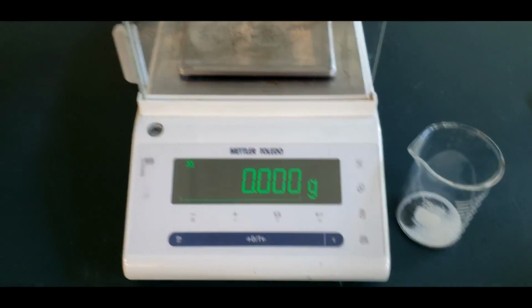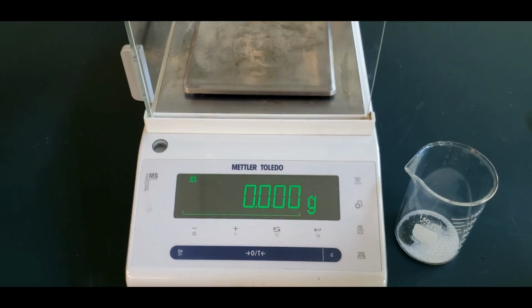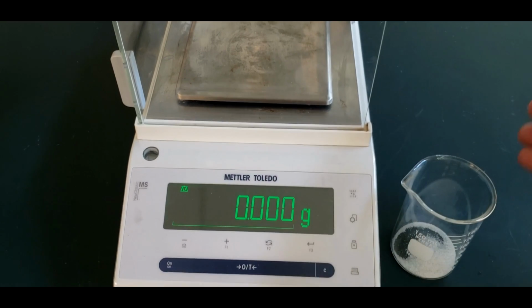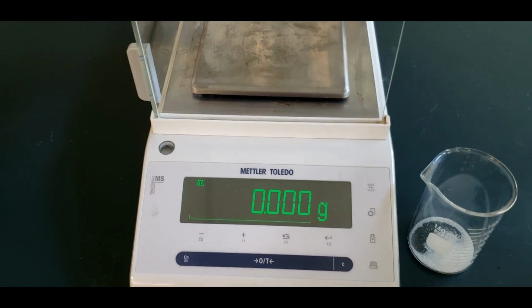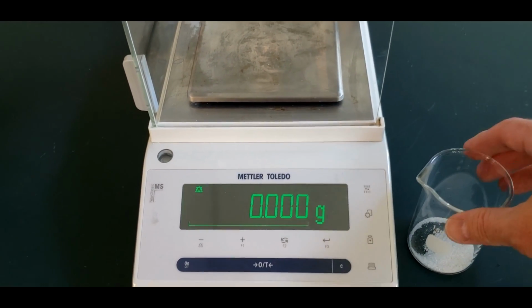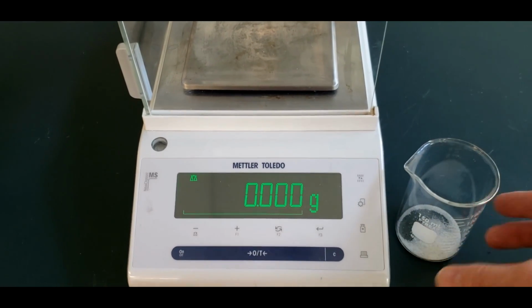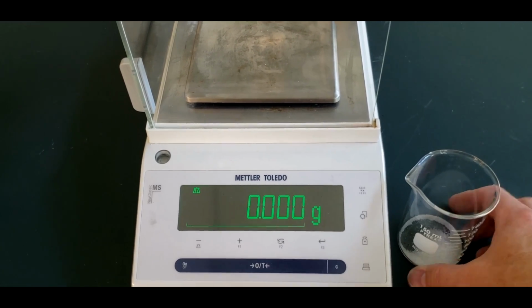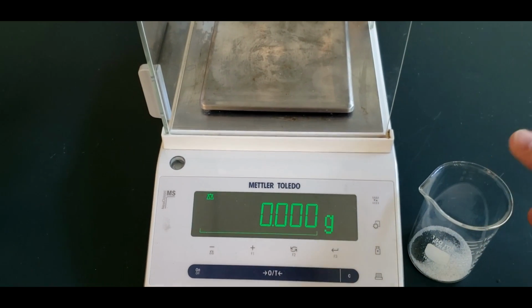And now students will ask, how do I know when it's cool enough to touch? Well, first, if you're ever in doubt, you can just put your fingers by it. If you feel heat coming off of it, it's too hot. But what I always do is just let it sit for 5 minutes, and you're guaranteed for a beaker, at least the top you should be able to touch. And then from there you can just see if it's okay. But this has been sitting almost for 10 minutes, and the bottom I feel is just slightly warm. But yeah, if you're really concerned, just let whatever you've heated up sit for 10 minutes. You're going to be fine.